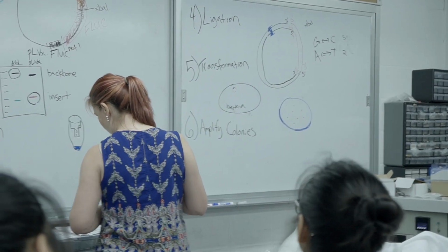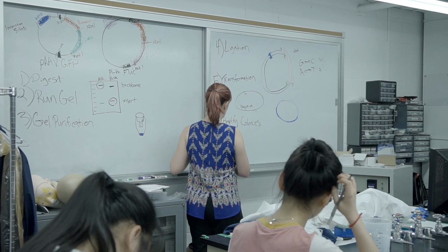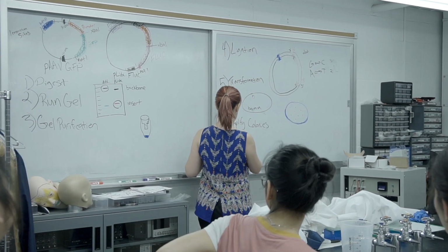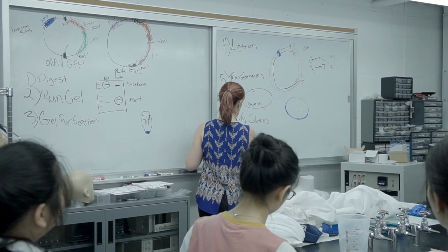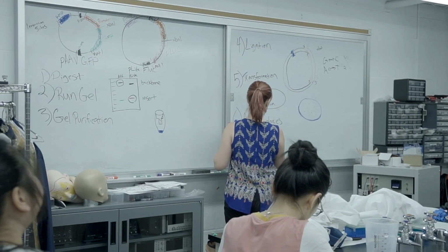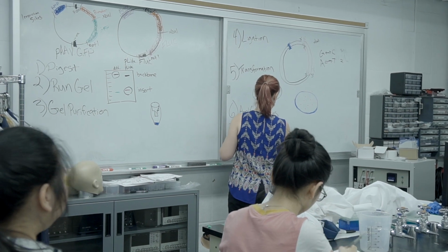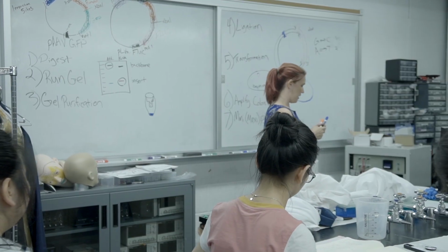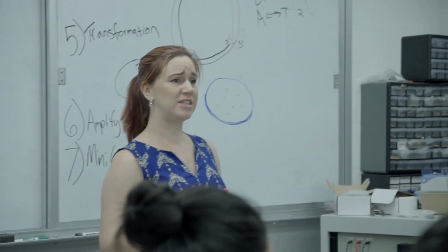And then I'm going to have to purify those. And this was actually the first thing I ever really did when I did my first lab internship in a molecular biology lab. You're going to do something called a mini prep or a maxi prep. So the next morning, we want to get our plasmid out. So what are some steps we're going to do for that? It's in our bacteria right now. So how are we going to get our DNA out of our bacteria?